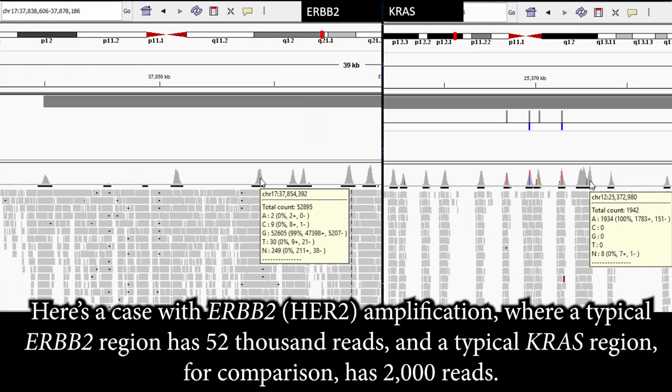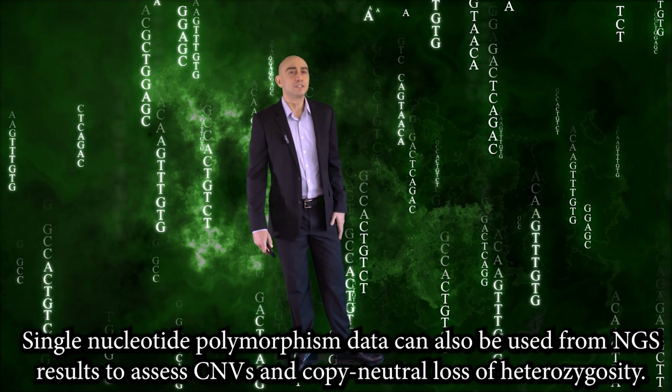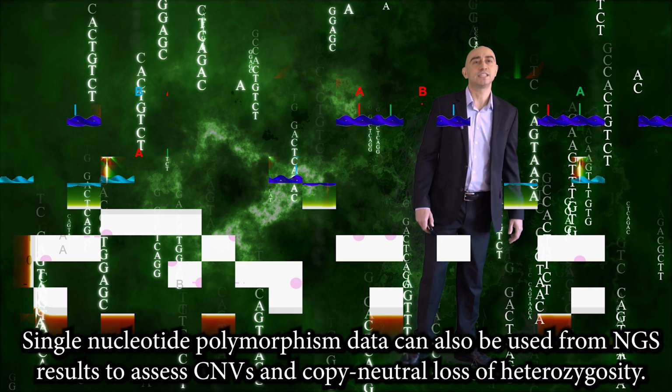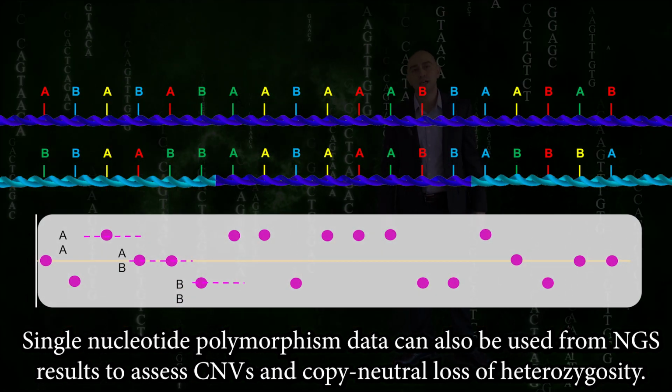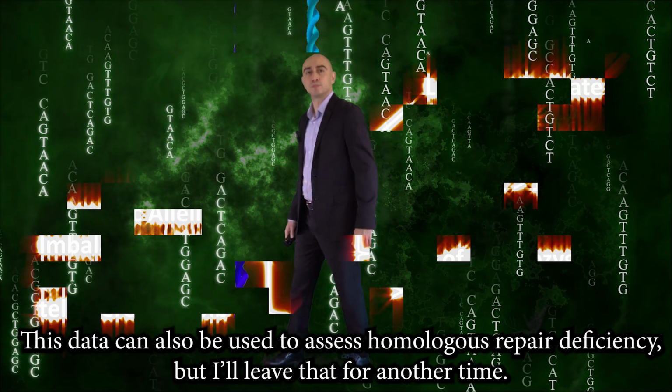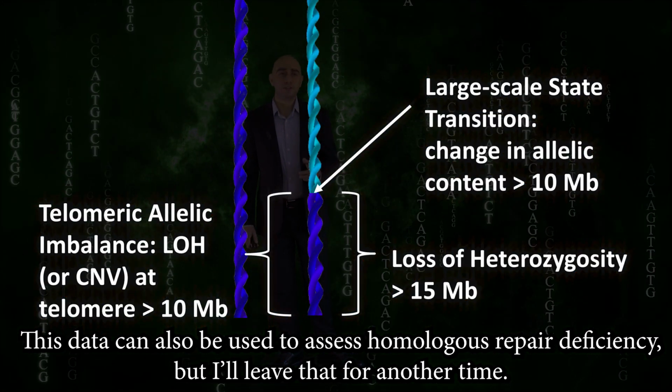Here's a case with ERBB2 HER2 amplification, where a typical ERBB2 region has about 52,000 reads, and a typical KRAS region for comparison has 2,000 reads. Single nucleotide polymorphism data can also be used from NGS results to assess CNVs and copy-neutral loss of heterozygosity. This data can also be used to assess homologous repair deficiency, but I'll leave that for another time.